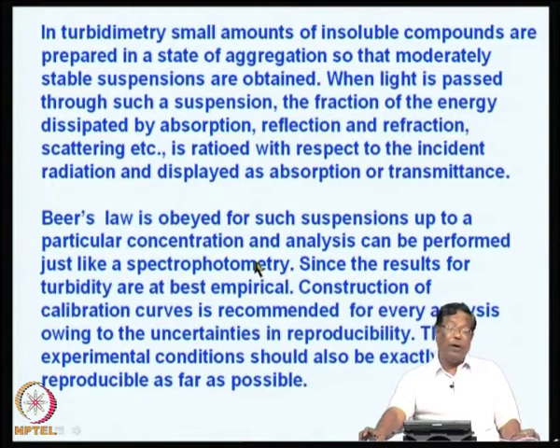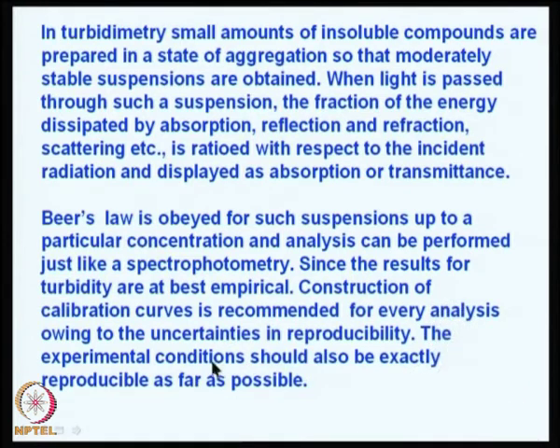Since the results for turbidity are at best empirical, construction of calibration curves is recommended. That means, whenever the results are empirical, you have to have a calibration every time you do this kind of analysis using turbidimetry, because of the uncertainties involved in reproducibility. Therefore, the experimental conditions must be reproducible as far as possible.